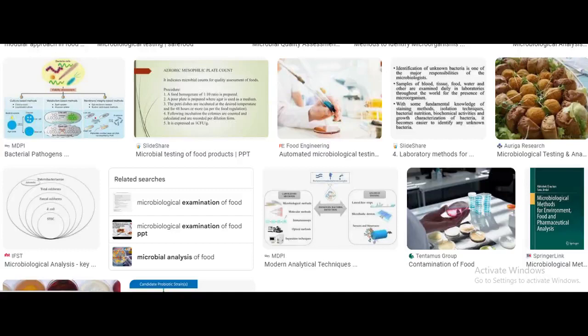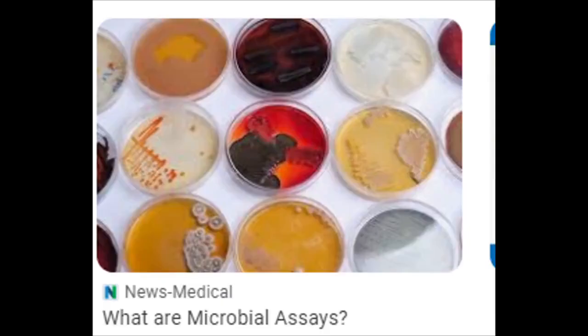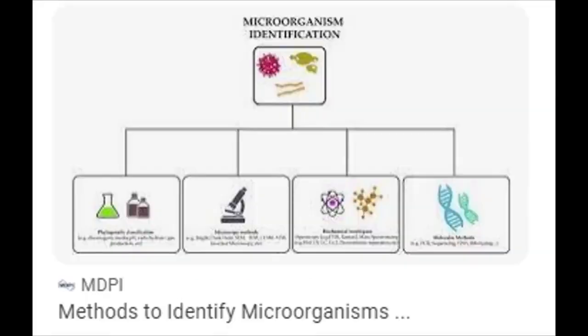So even though you're engineers, there's space in your memory, your medulla oblongata and cerebellum, for all this microbiology stuff. If you're engineering students, it's a professional course, so microbiology should not be a big deal for you, I must say. We have different kinds of media: general purpose media, selective media, and many other kinds of media that are available. You will see all this in the material we're going to give you.